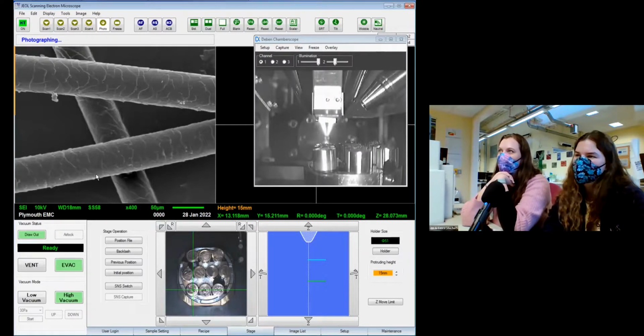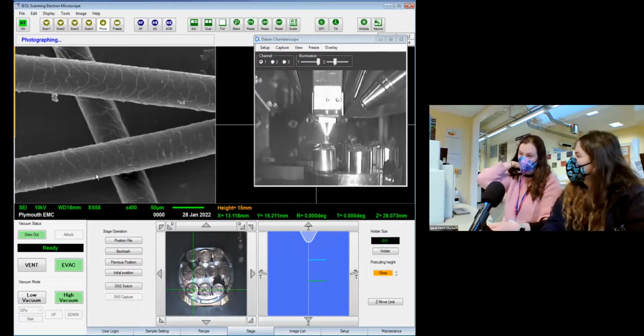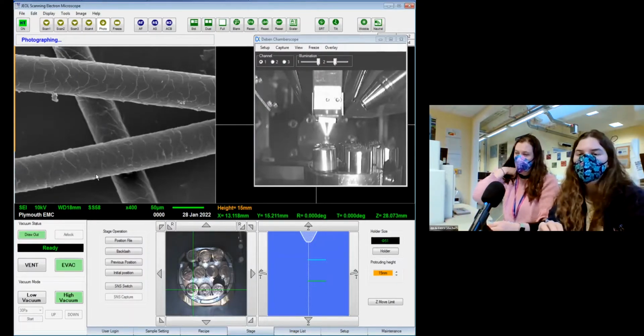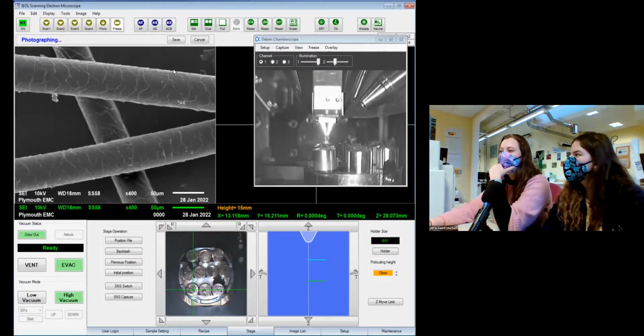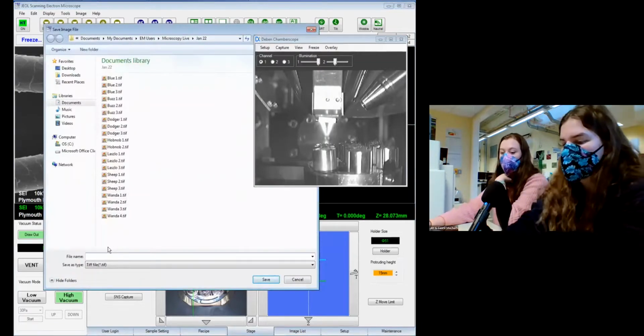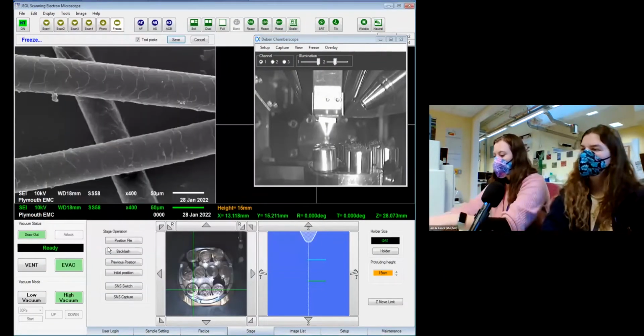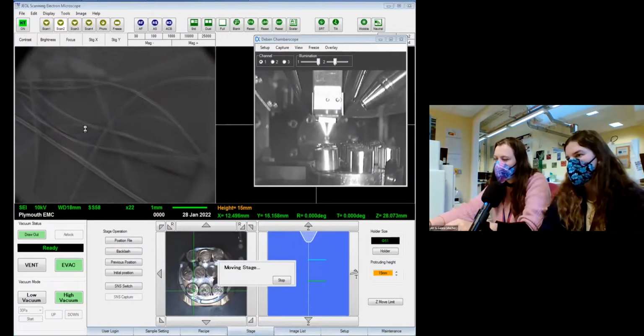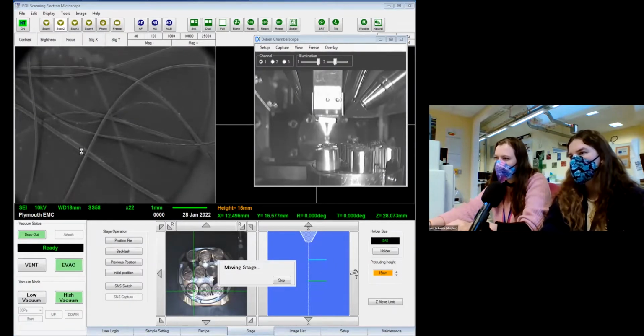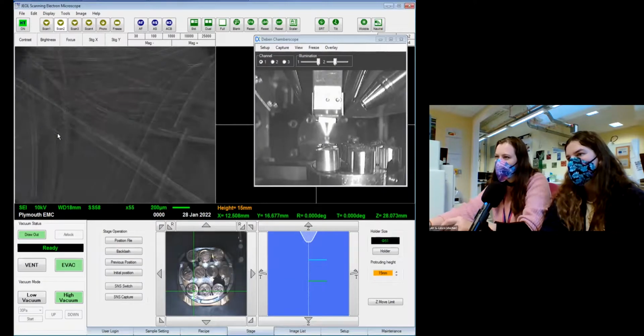So this is much more similar to that Corsair and Buzzard's coat. I suppose German Shepherds are working dogs as well. Is it quite smooth to stroke? Yeah, it's quite smooth. You can see that there's two coats: the long, thicker, coarse outer coat, and then a wavy and curly, fluffy inner undercoat. I think this might be the outer coat. I get a smooth, coarse vibe from this hair. I wonder if I got any of his inner coat on this. Ooh, that hair maybe looks really coarse. Let's think about there, see what happens.